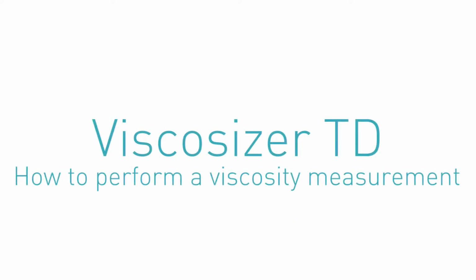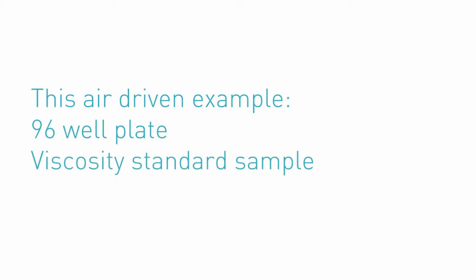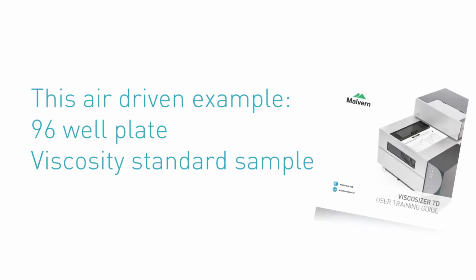Welcome to the Viscosizer TD How to Perform a Viscosity Measurement tutorial. In this air-driven viscosity example, the 96 well plate will be used with a viscosity standard sample. For more information on running viscosity measurements, please see the Viscosizer TD user training guide.